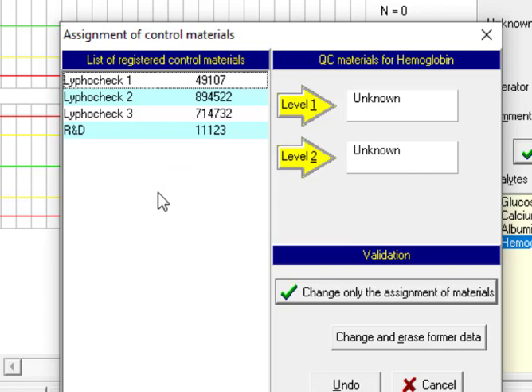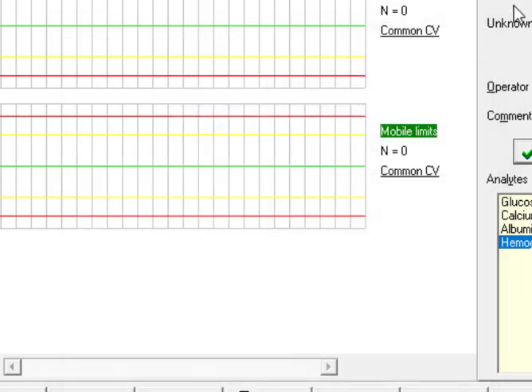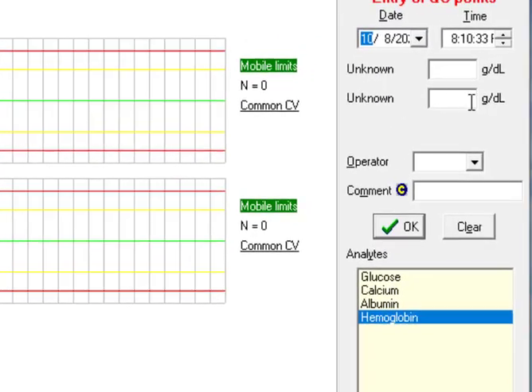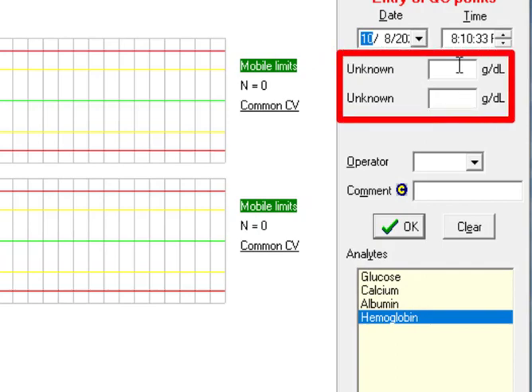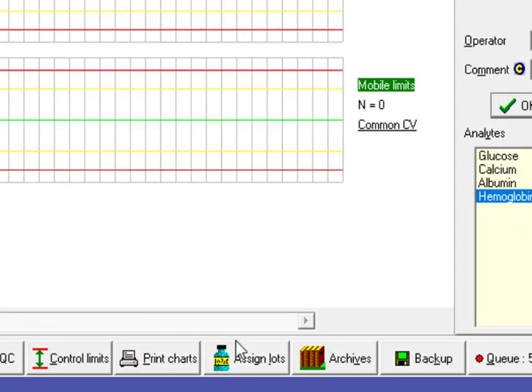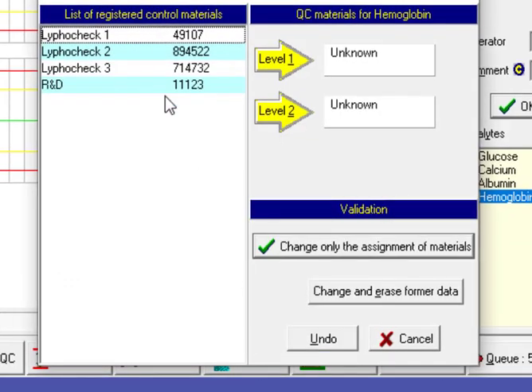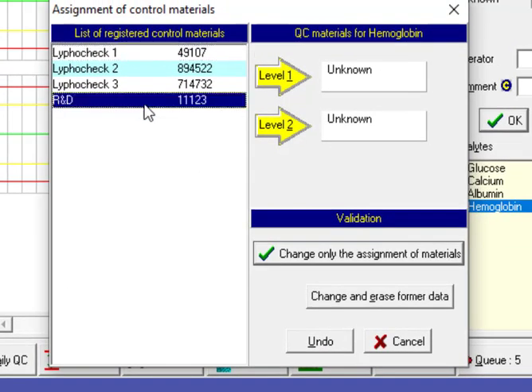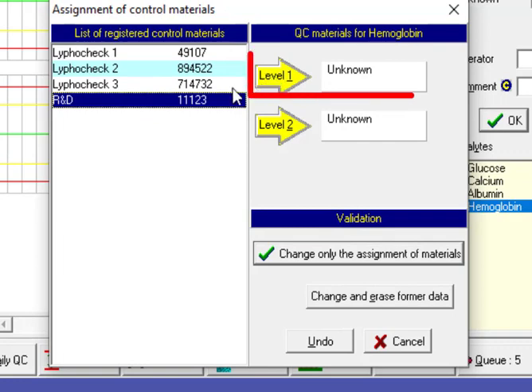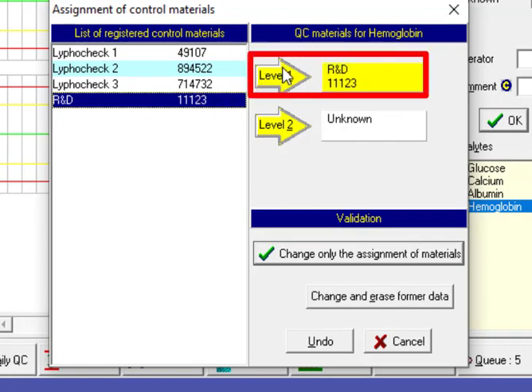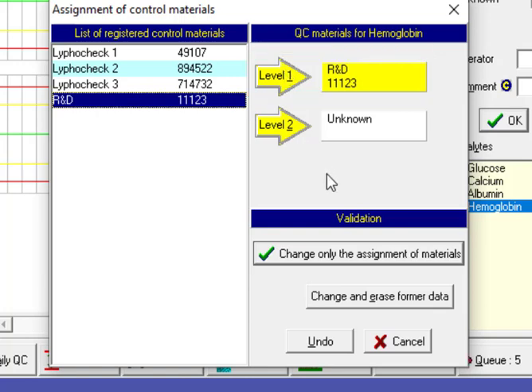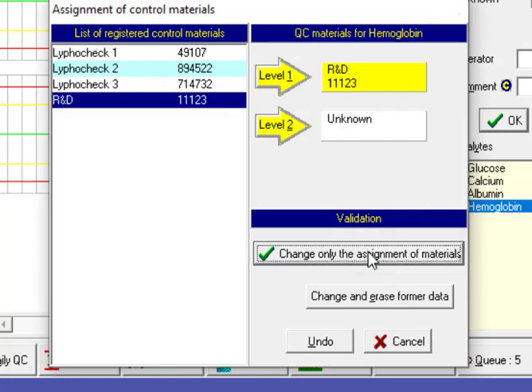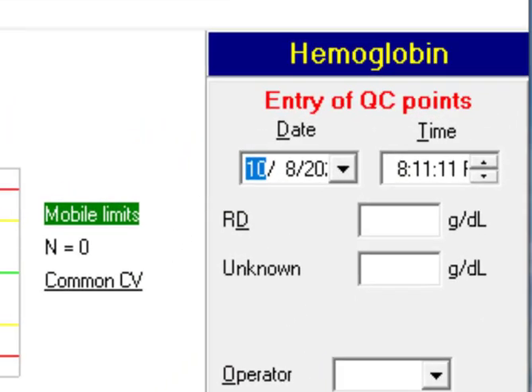As you see here you need to assign control materials for each level. We assign R&D for first level. We press change only the assignment of materials validated by pressing this item, R&D.